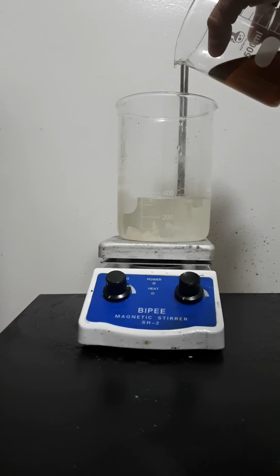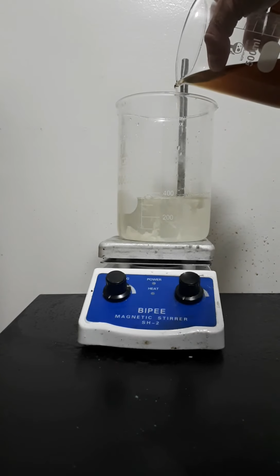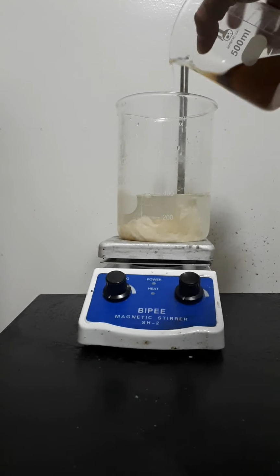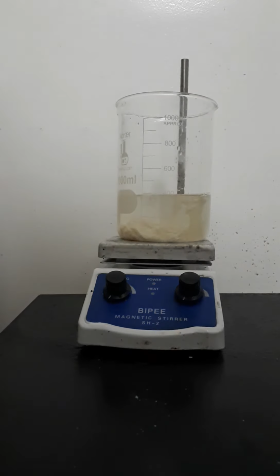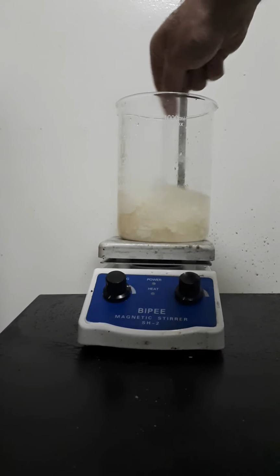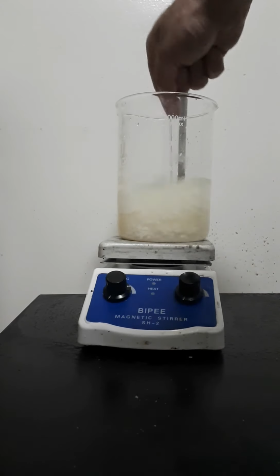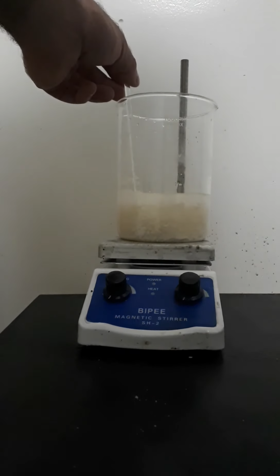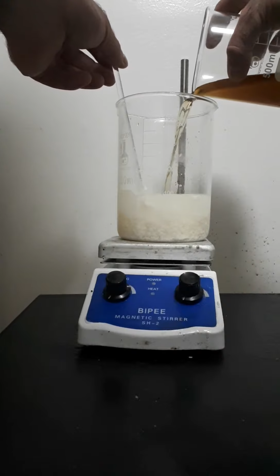It's going to be an exothermic reaction, so we'll have to do it slowly. What you see there is calcium sulfate that is precipitating. So I'm going to add the rest of it gradually.